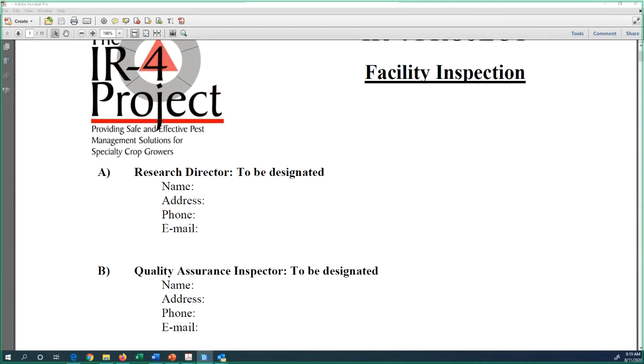And even if you talk to EPA, they will say no. So it is difficult to give you exactly a yes or no answer at this time. If your method uses matrix-matching standards, period, you are good to go.